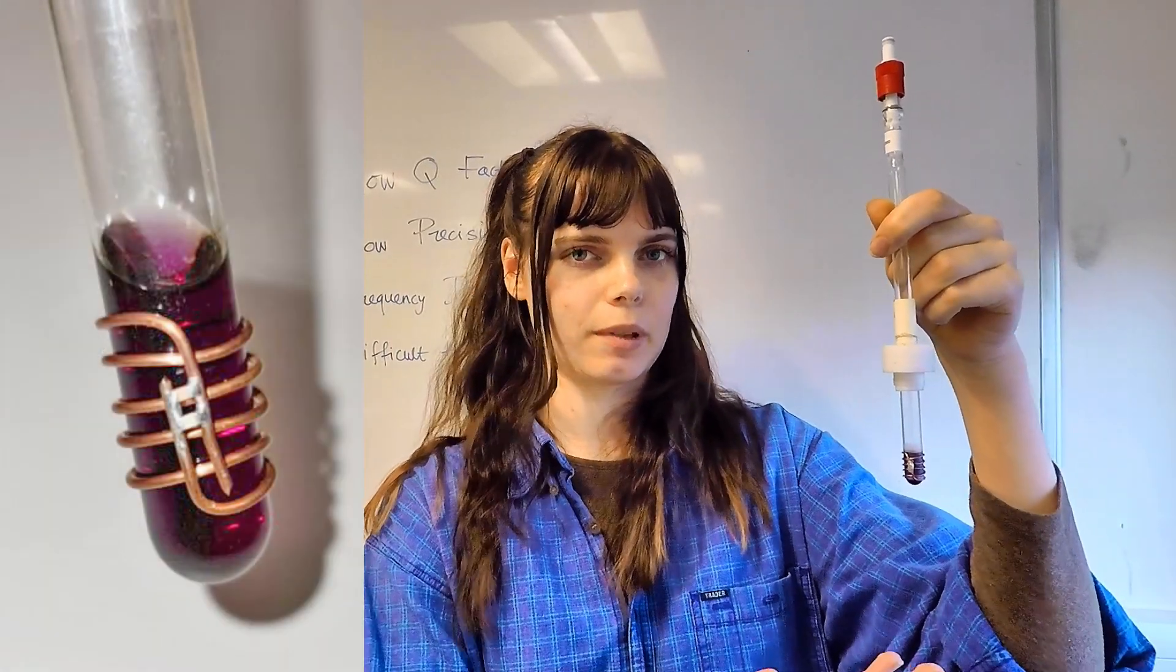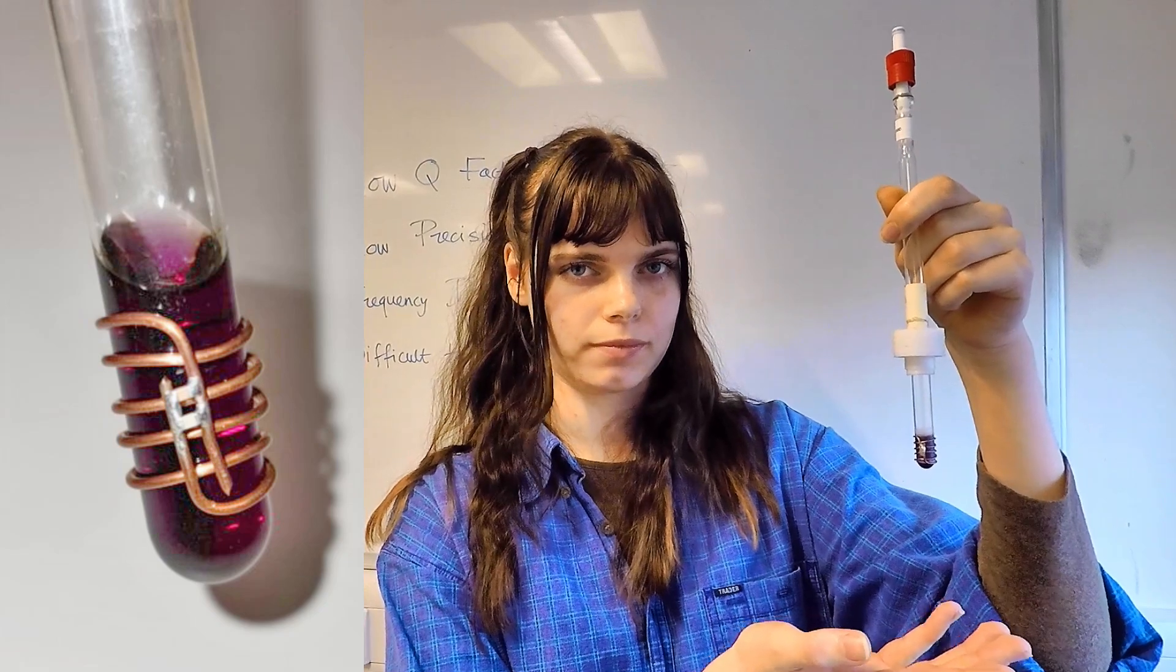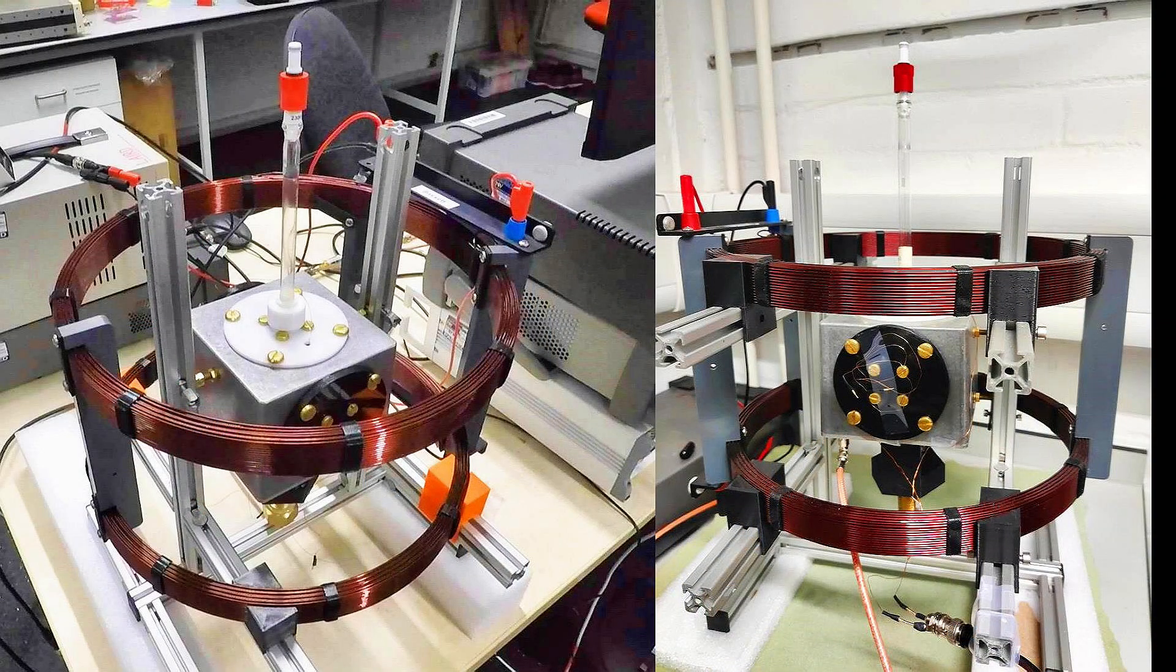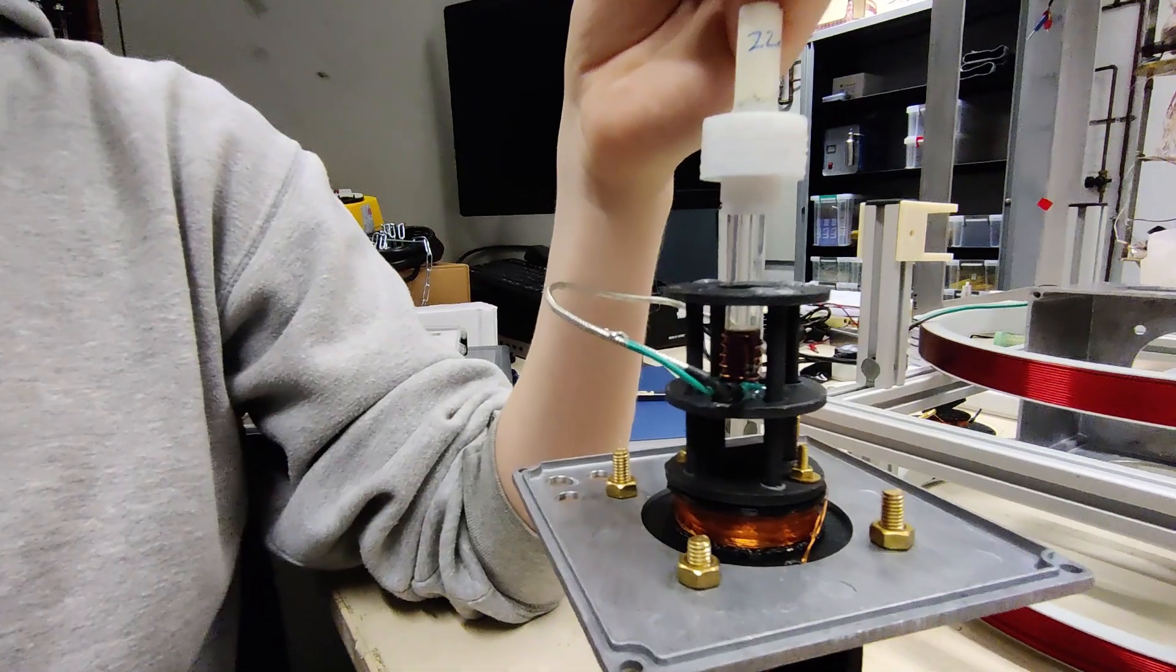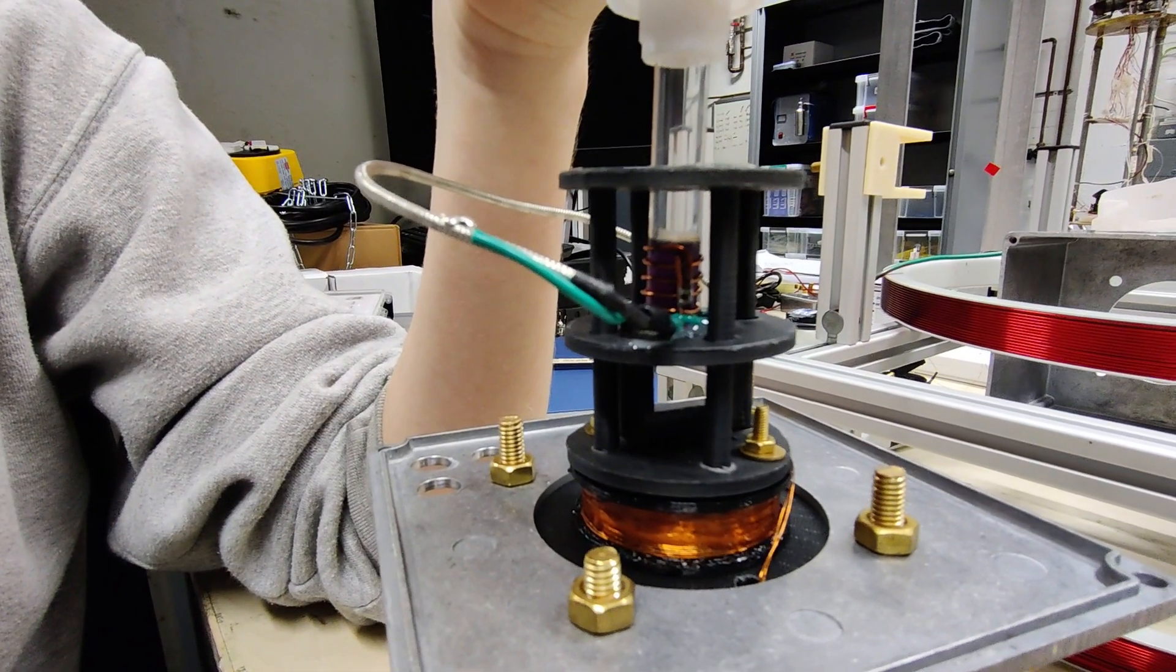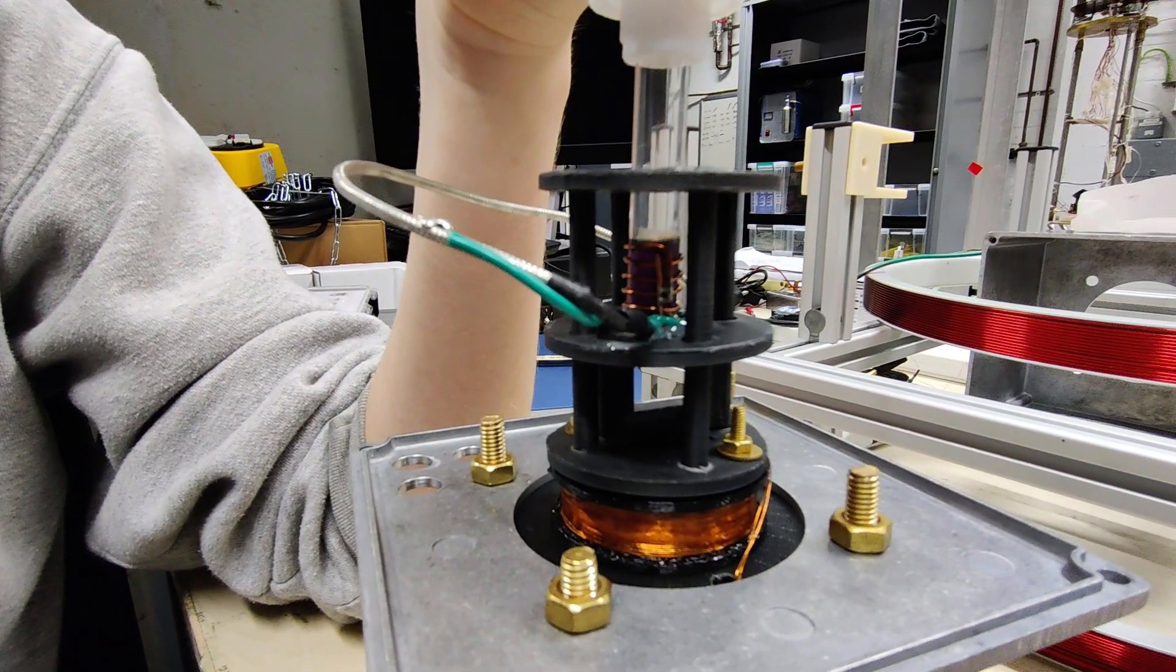We use a liquid sample in a vacuum tube and this is how our resonator sits on that tube. For context, here is our EPR spectrometer. This is how the sample and resonator fit inside the spectrometer where the resonator is inductively coupled to the coupling loop.